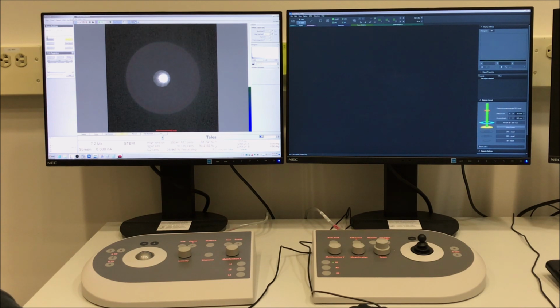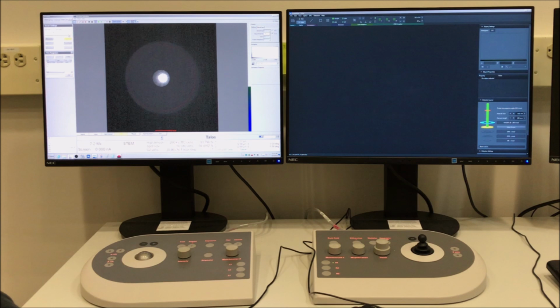And then you can select the Beam tab in Microscope Control, then go to the Beam Settings control panel and set your numerical value of spot size. You have to make this adjustment to the spot size once you go into STEM mode. The spot size that you have in conventional mode doesn't transfer over when you enter STEM mode. And again, we of course know that a higher numerical value of spot size means a smaller beam.